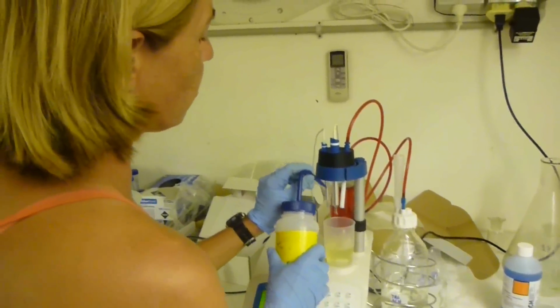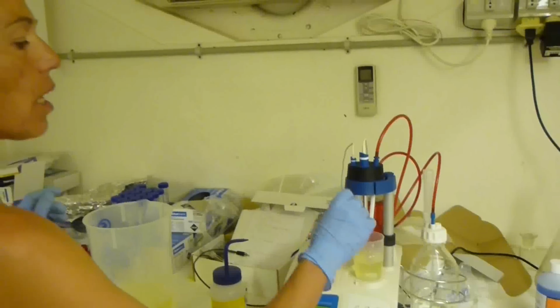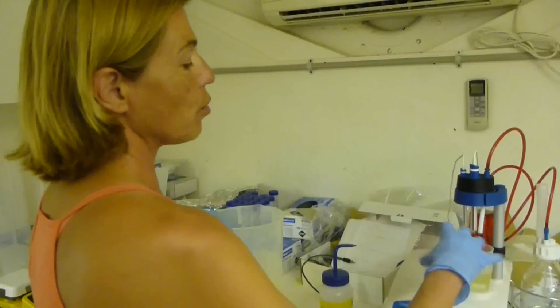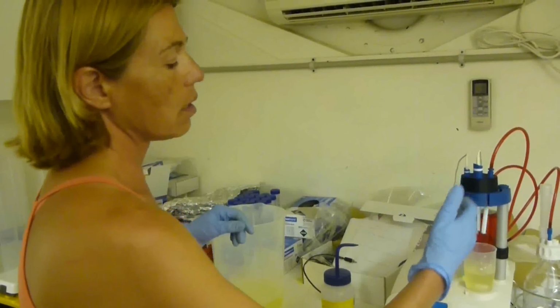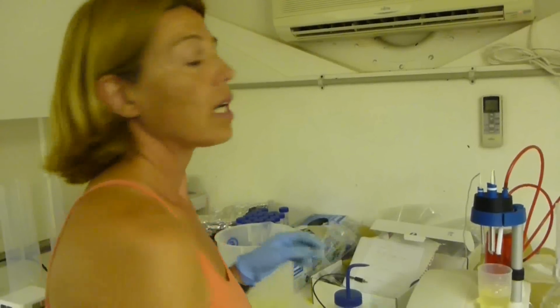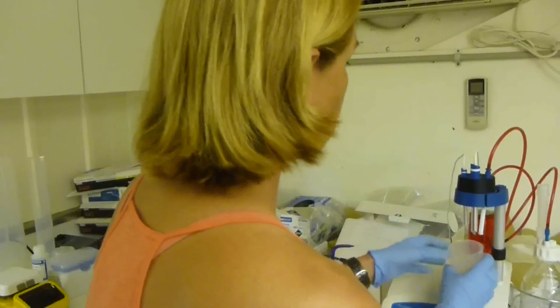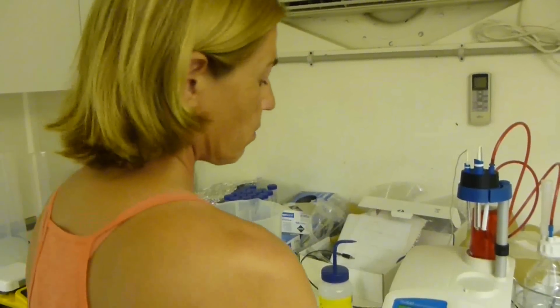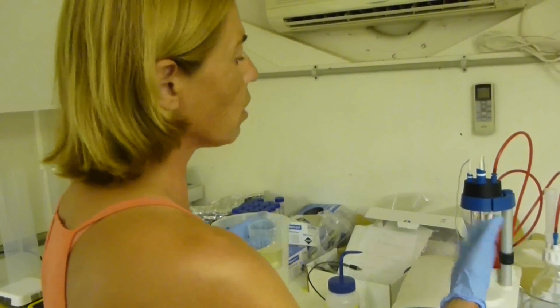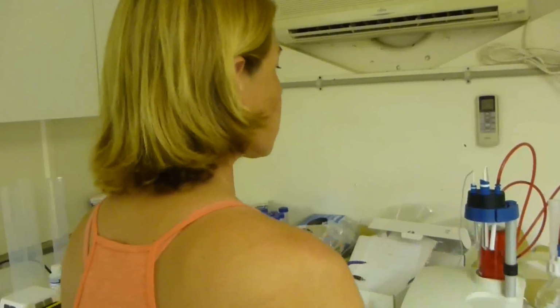The really old-fashioned method goes with starch as an indicator, so it's even more impressive. You put some starch and it gets blue, and when the titration is done, it's transparent like this, and you decide for the endpoint by yourself. In this case, there is an electrode that measures millivolts, and we just tell her when to stop, so I don't have to look at it, and I don't need to keep a special light.